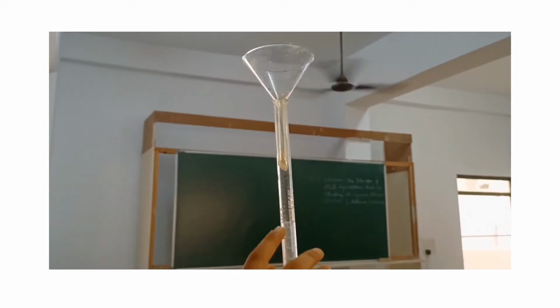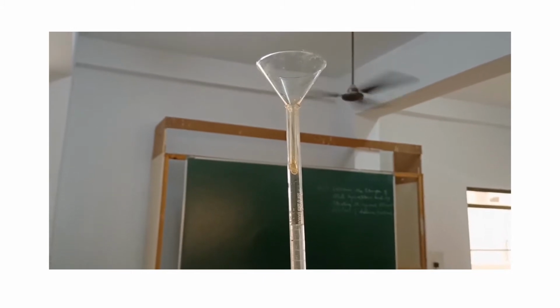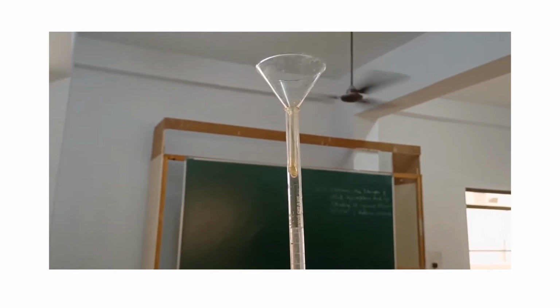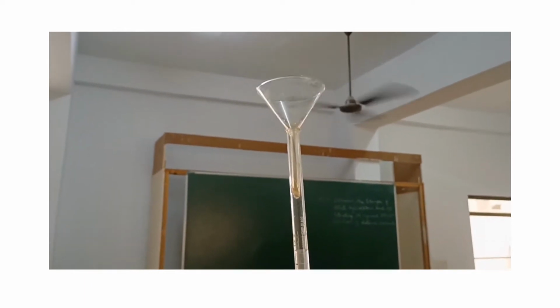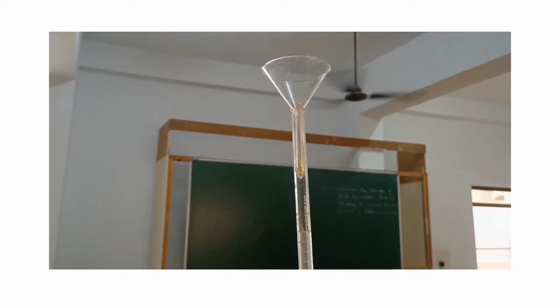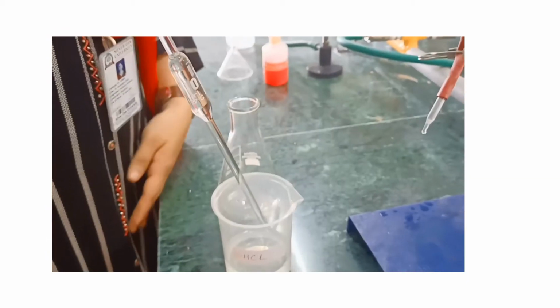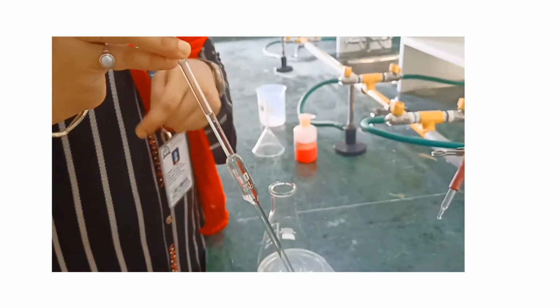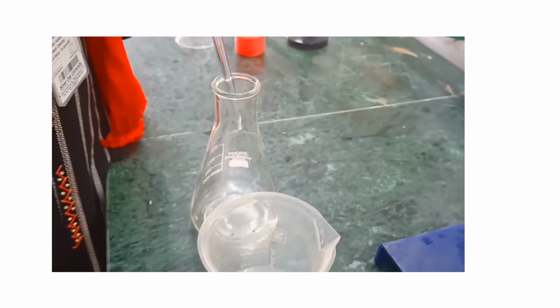So we will fill up to the 0 mark. If there is an excess, then we will remove it by opening. So you can see that by slight opening, we will make it up to the 0 mark. So here up to the mark we have filled it up. Now transfer to the flask.